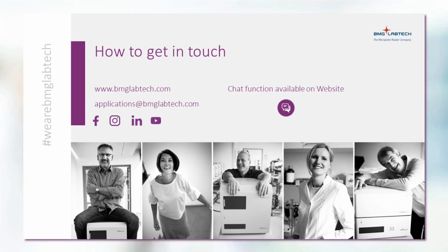This question starts off by saying thank you for the talk, and they would like to know how to set gain in kinetic fluorescent assays where fluorescence is expected to increase throughout time.